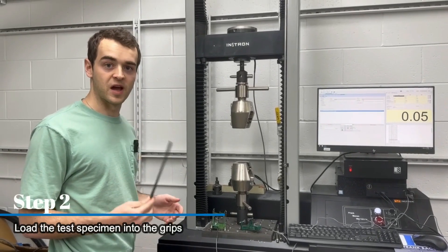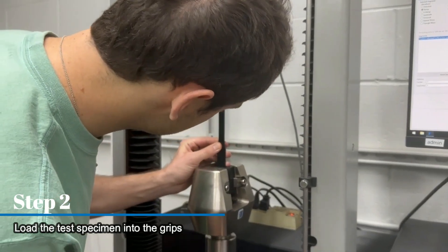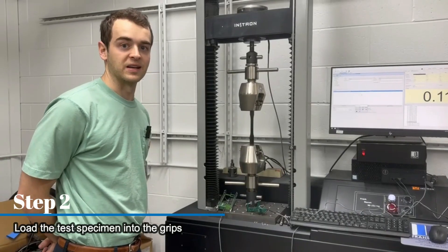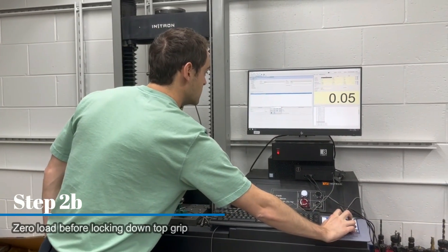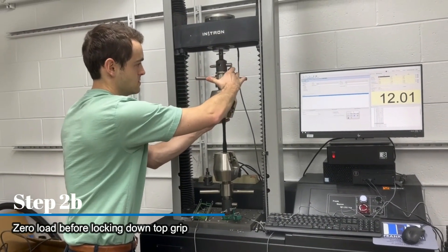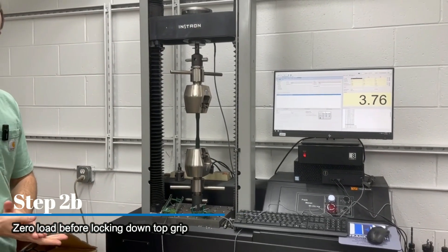Step two is loading up your sample into your grips. We're going to get this sample locked down on the bottom before locking down our top grip. We're going to zero the software out because we're actually going to be placing a live load on the sample. We've got a couple pounds of load on the sample right now.